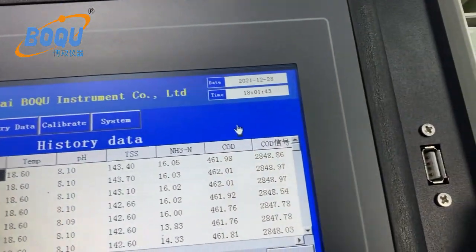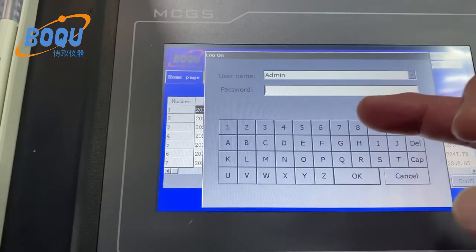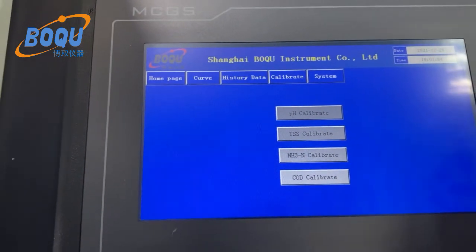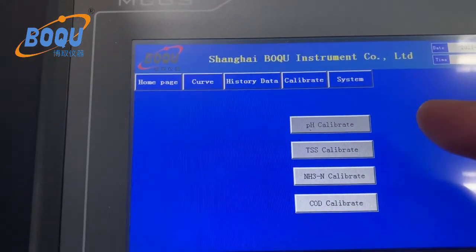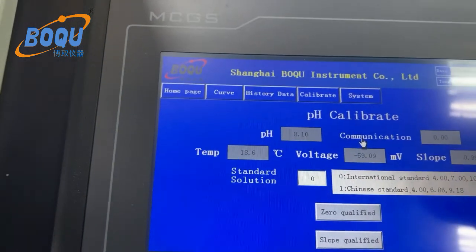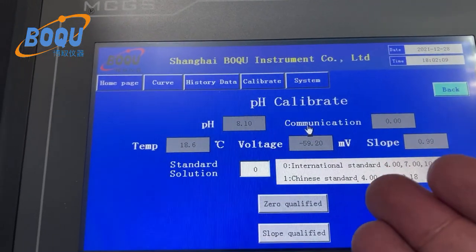Here is the USB port. Now we can check the calibration. Enter the password. All operations are performed on this touch screen. Here is the pH meter — pH calibration, TSS, ammonium nitrogen, and COD. For pH, you select the calibration buffer.